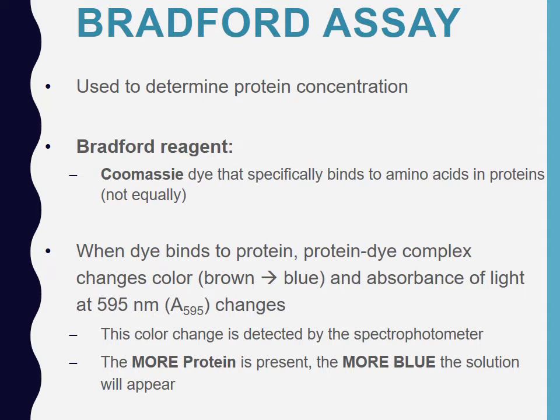Now, it's going to be important when you run this assay that you add Bradford not only to your 2 food samples, but the Bradford reagent also has to get added to all of your standards that you are going to use to generate a standard curve. Now, typically your laboratory instructor will have the standards prepared for you and you'll just have to spec them, but do know that it is very important that Bradford has been added to those samples as well so that we can actually measure their absorbance.